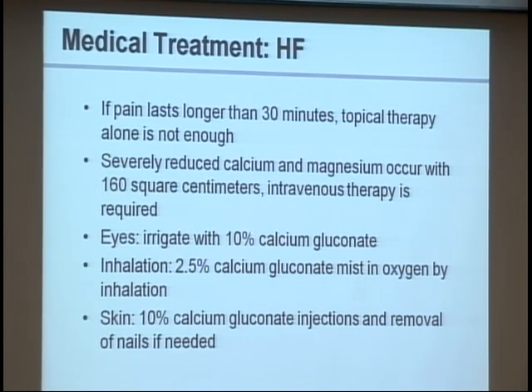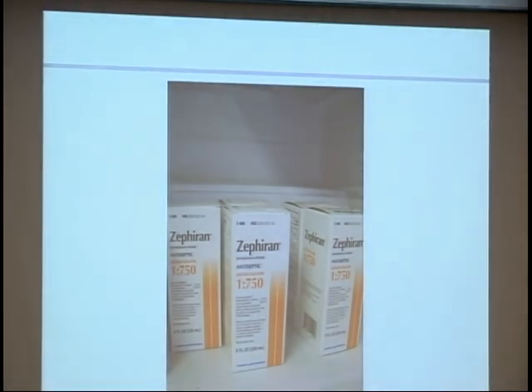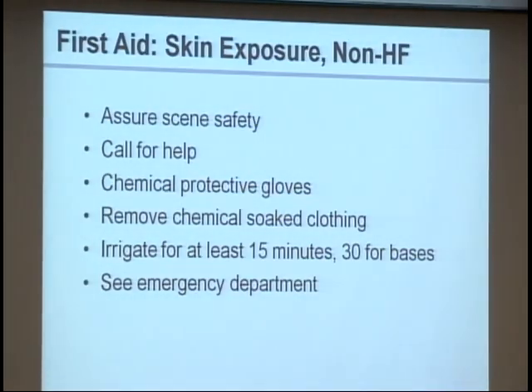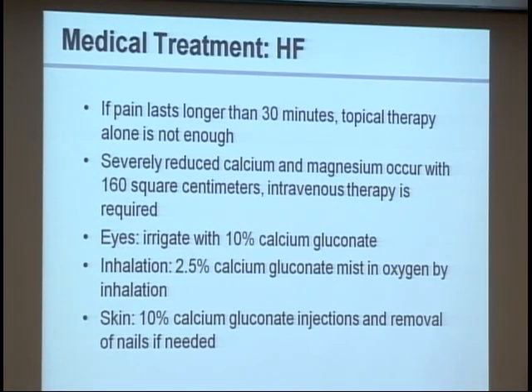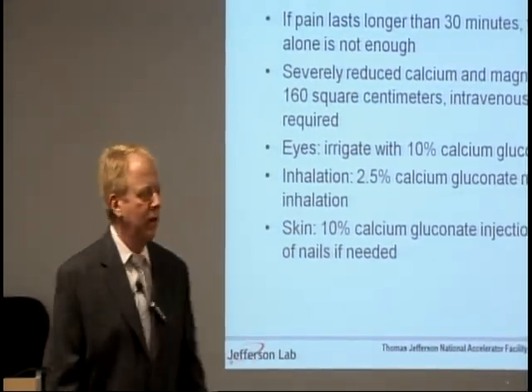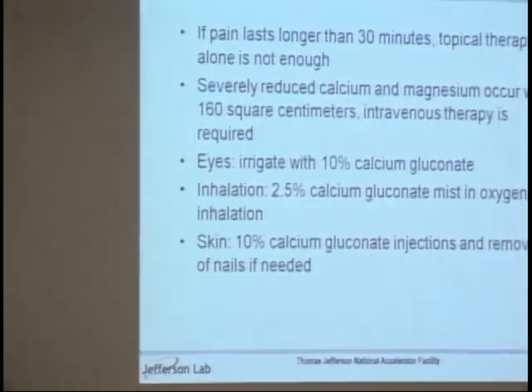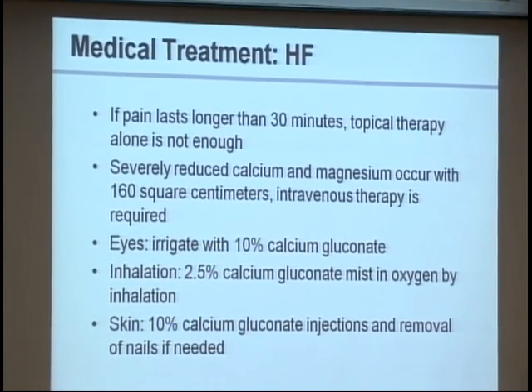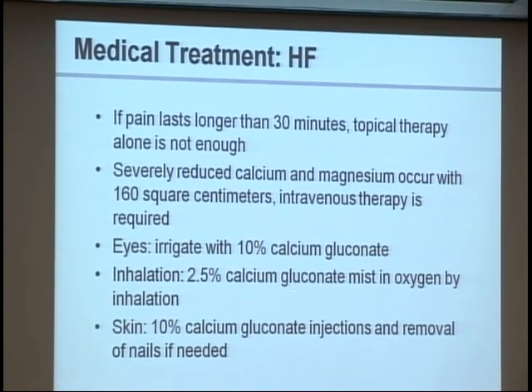For eye exposures, doctors will irrigate with 10% calcium gluconate — the same stuff that was in the gel. For inhalation, calcium gluconate can be delivered in a mist via a nebulizer, similar to what asthma patients use. This helps prevent the pulmonary edema we discussed. For skin exposures, they'll inject calcium gluconate, and if there's any nail involvement, they have to remove the nail — it does grow back.